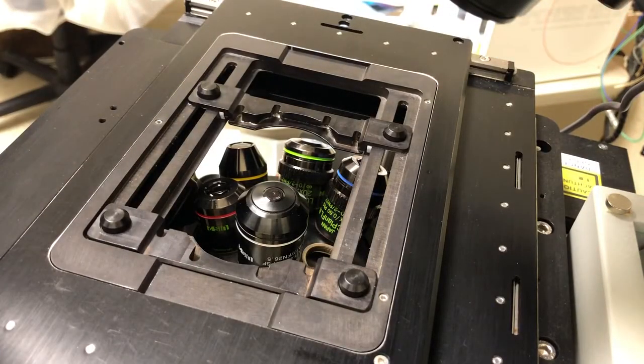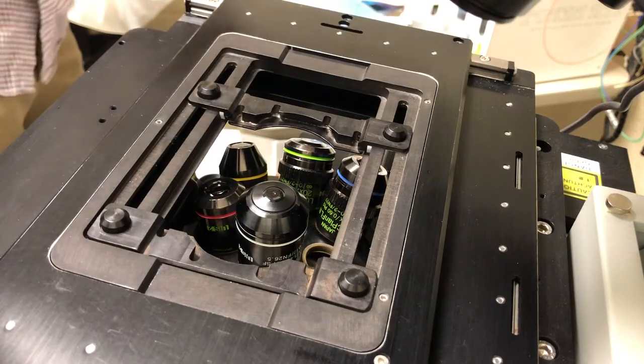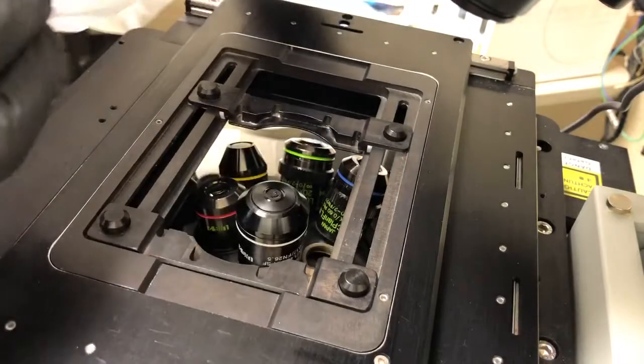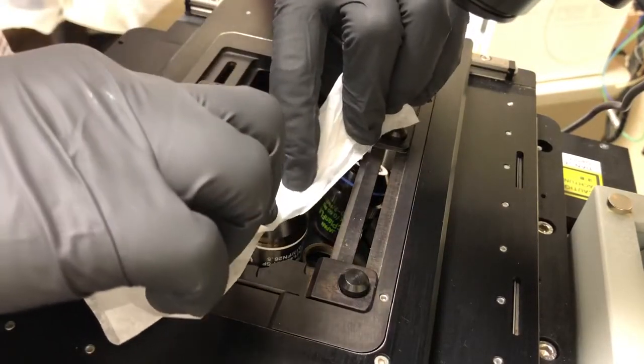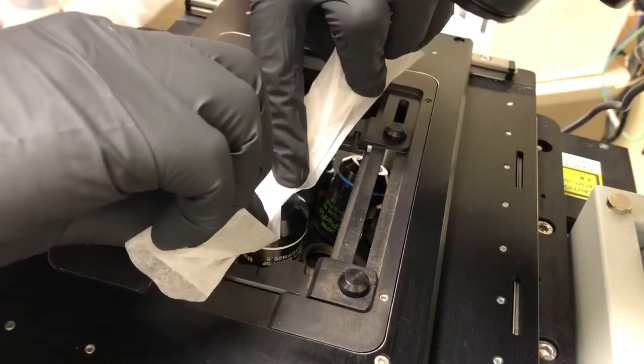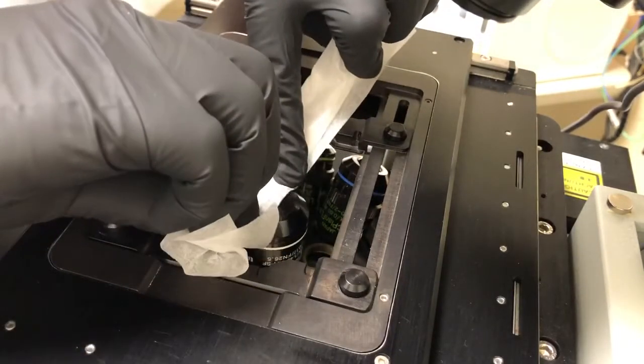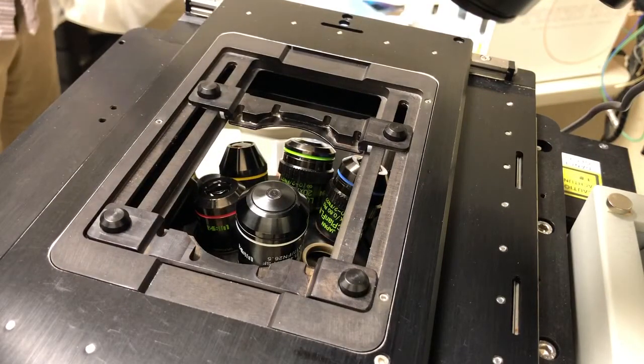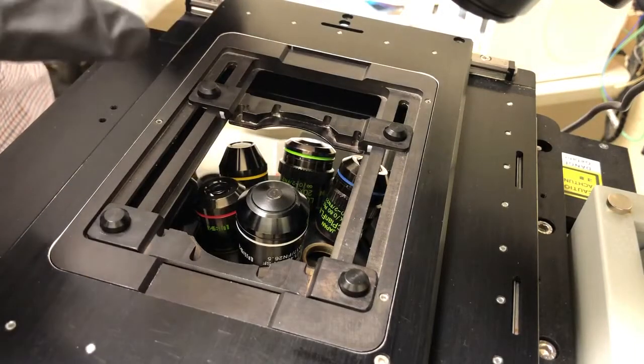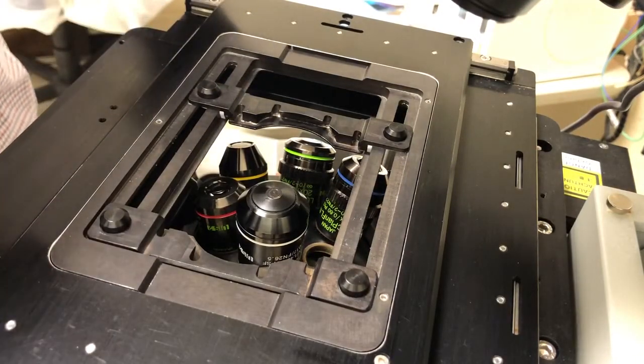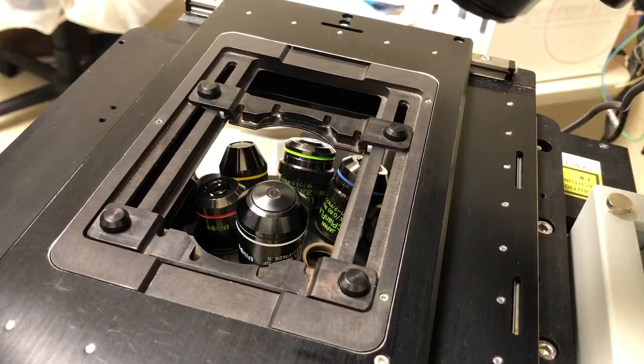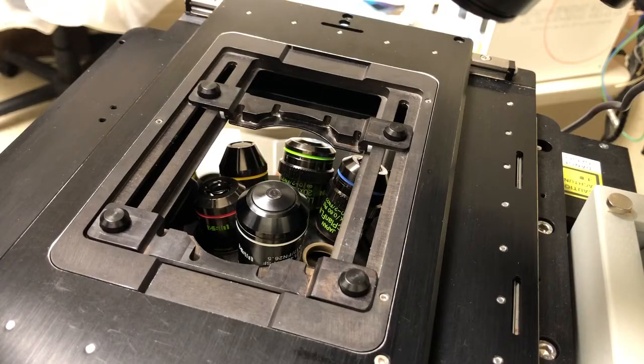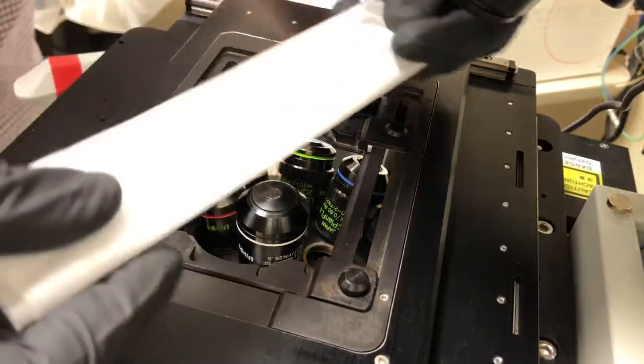The next step is to clean the objective. To do that, get lens paper, fold it, and gently wipe across the objective's face. Next, we'll use lens paper with ethanol or 70% ethanol. I've discovered that 70% works a little better, so we'll use that. We'll put a little bit on it like this, and then swipe across like that.